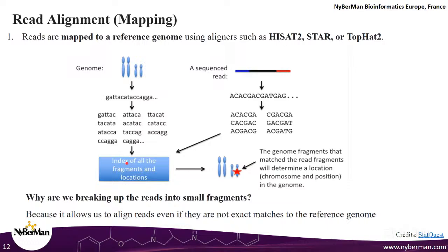Okay, this indexing is the same as the index you see at the end of your textbooks. Okay, which basically tells you which word is present on what page. You have an index right at the end of the textbook. If you're looking for a very niche word, a very particular word, instead of looking for that throughout the textbook, instead of starting from the first page and iterating over every page, you can simply go back to the index, right?